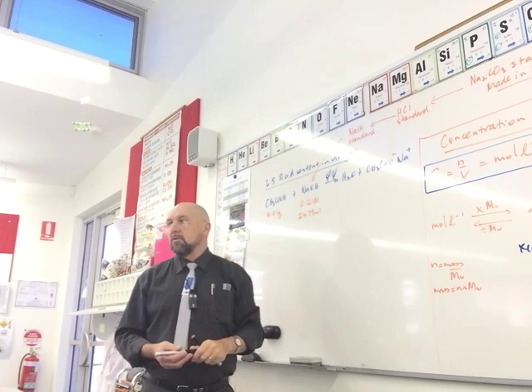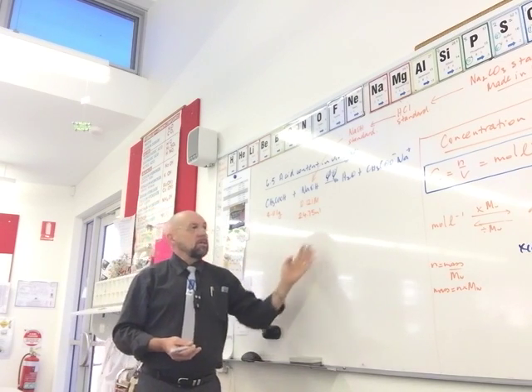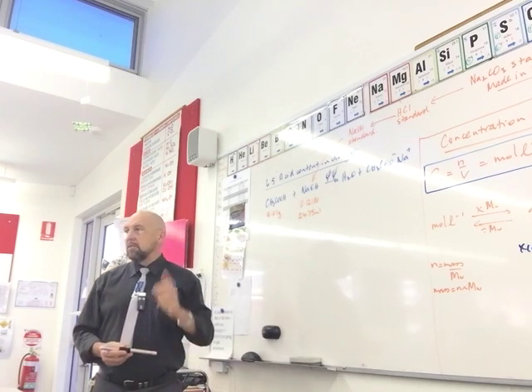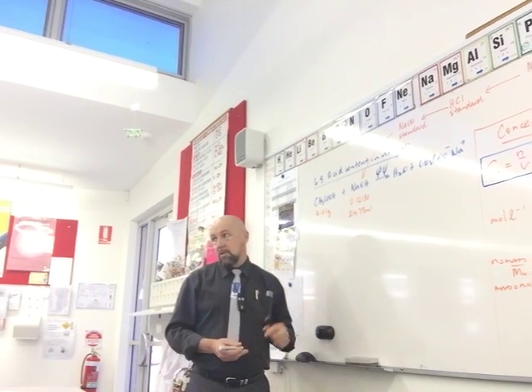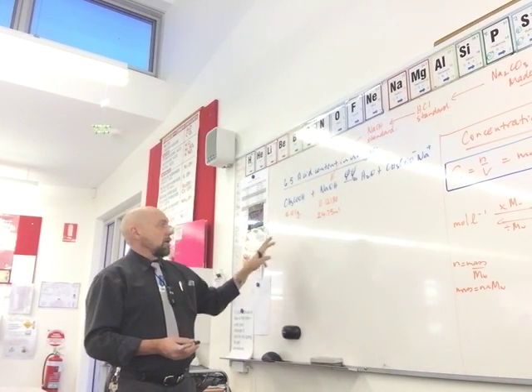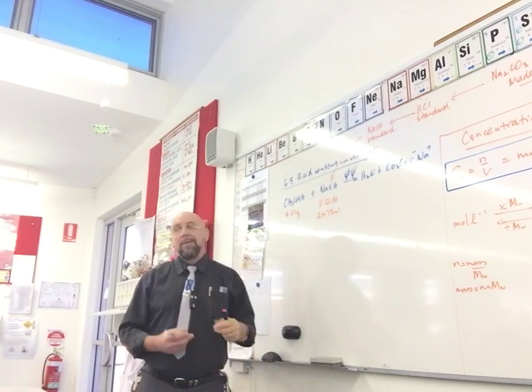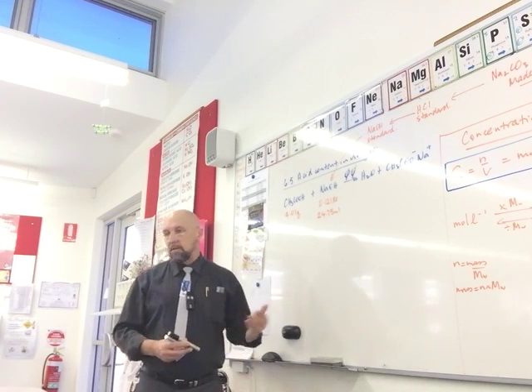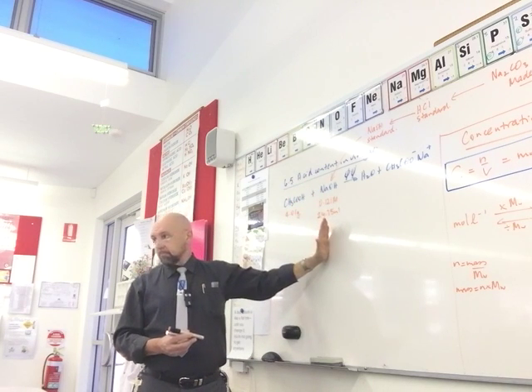Okay, some of you are still looking at me blankly. All right, let's go through the calculation, and hopefully that will clarify things. I've got Leandro's group and Senna's group results, and we'll work on your results. So you can help me as we go through. Every time we do a titration, we have to have a known, or a standard. We've worked our way right through. This is our standard. Here it is.